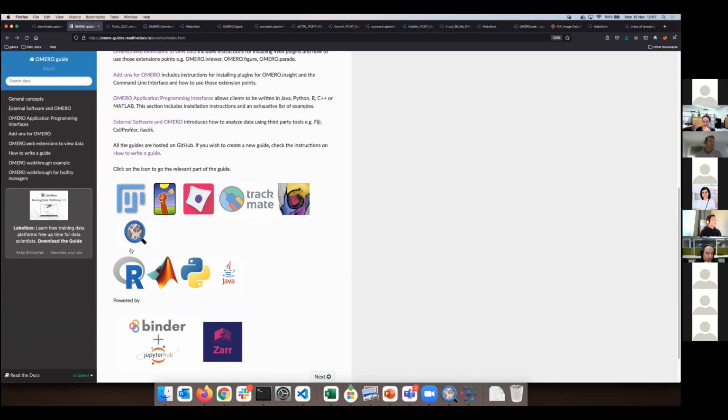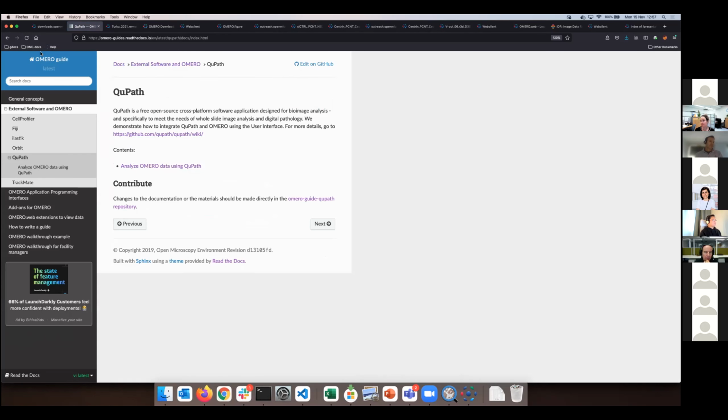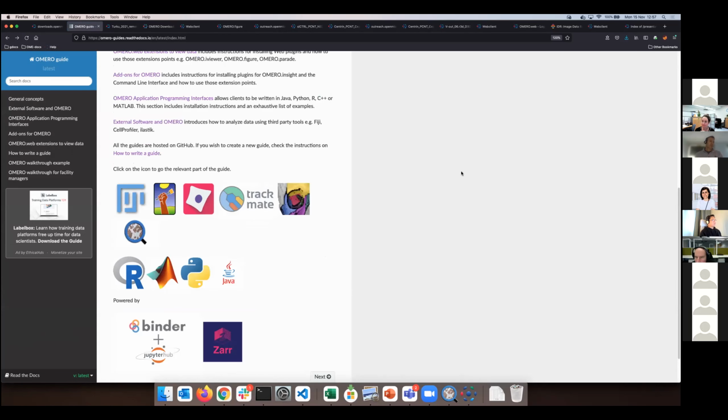Okay. Question, so, Peter, from Antti. Yes, let's do it. I unfortunately can't see the question in the chat. So just raise his hand. Right, I just raised the hand here. So the question was actually just about importing the files. Did I get it right? So there is no way in OMERO Web to import, but you only do that inside.